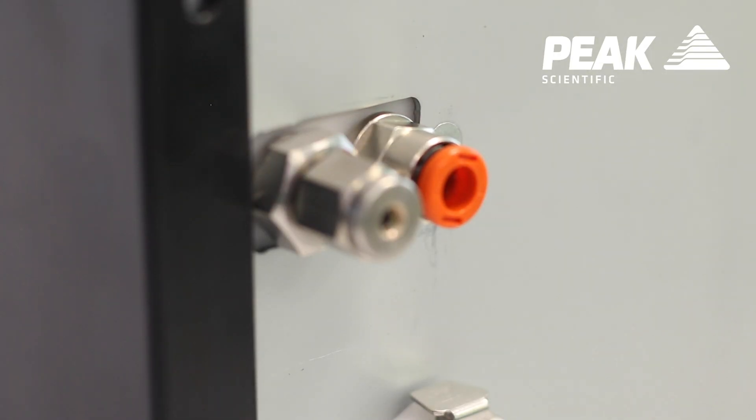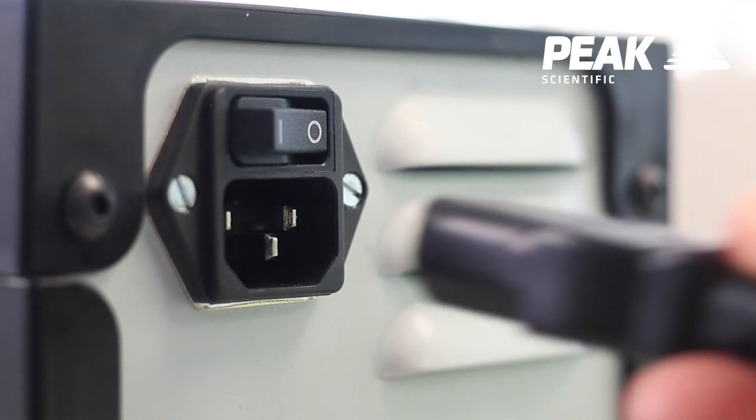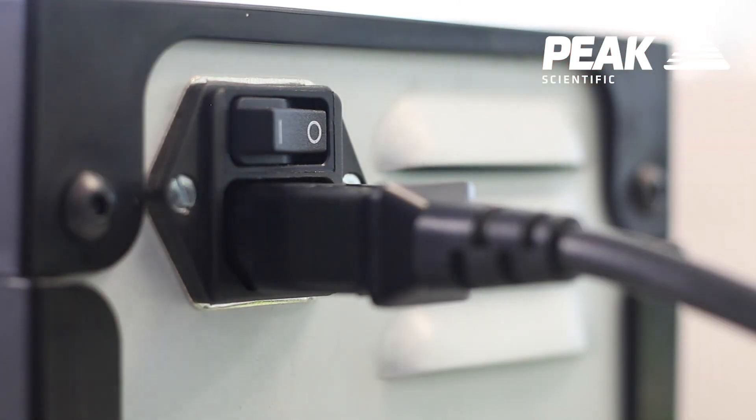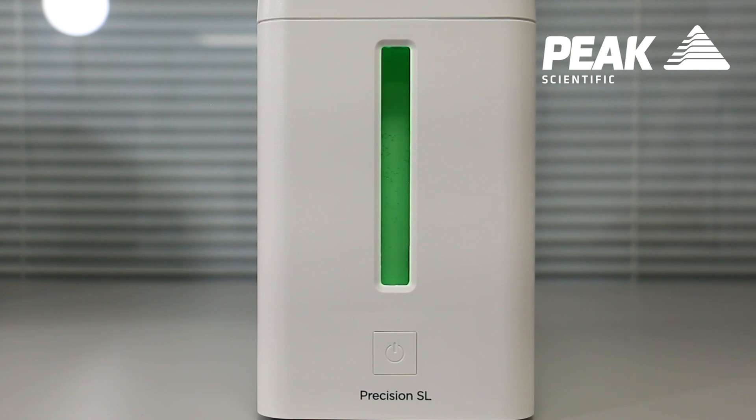Although Precision SL is a more compact generator, we haven't compromised on any of the safety features. When the system is started up, it will go through a self-diagnostic check to make sure that there are no internal leaks and that the system is ready to safely produce hydrogen. With Precision SL we have an incredibly small product that will produce enough gas to supply an entire lab for its detector gas needs.